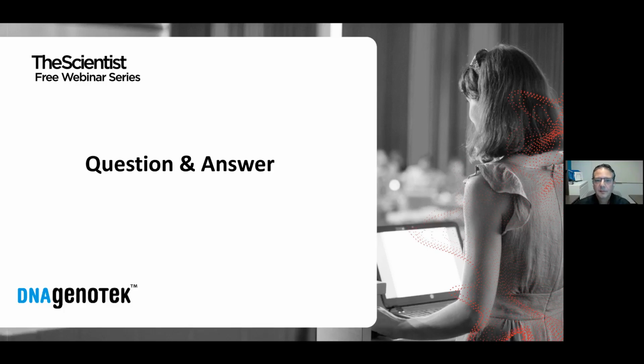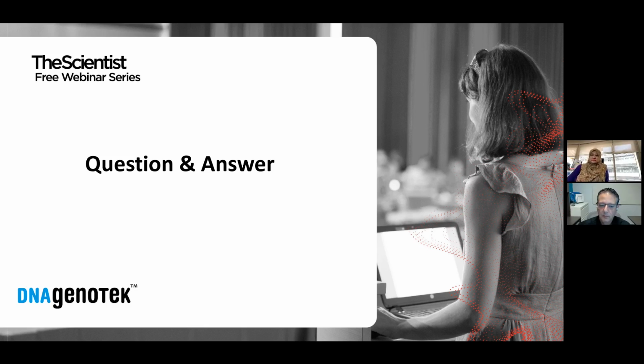Let's start with one for you, Mike. We have a question from the audience asking whether you have a suggestion for a low 260-230 ratio.